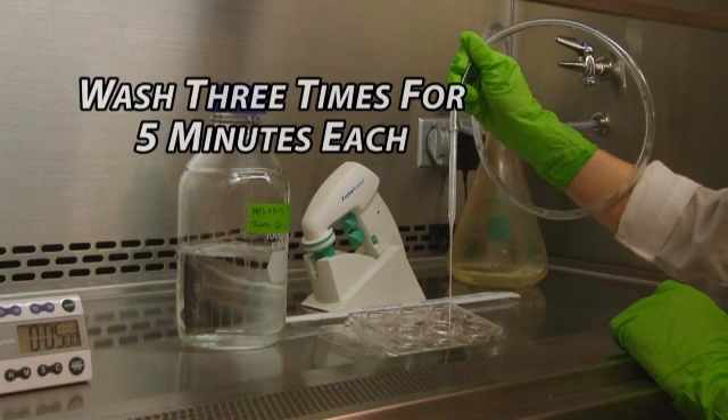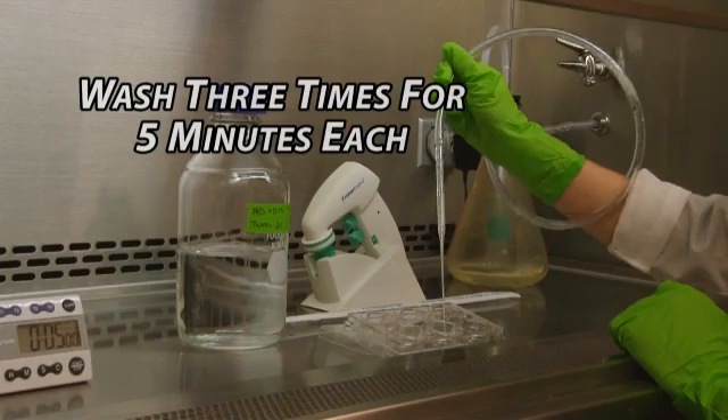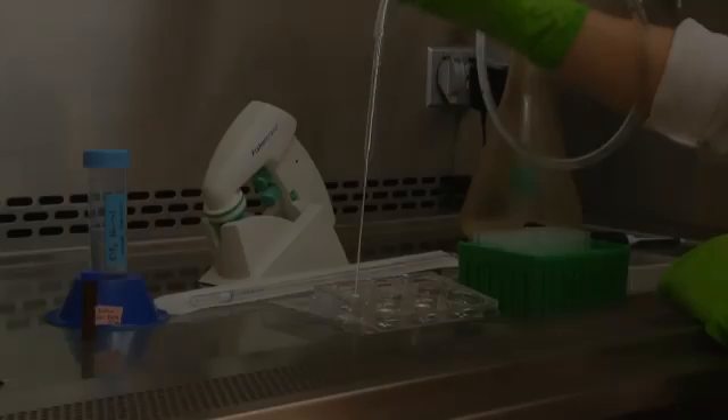First, we aspirate off primary antibody solution, followed by washing the cells three times with PBST for five minutes each.